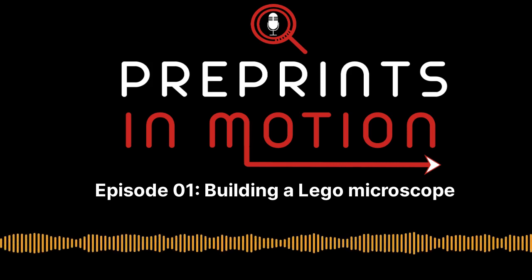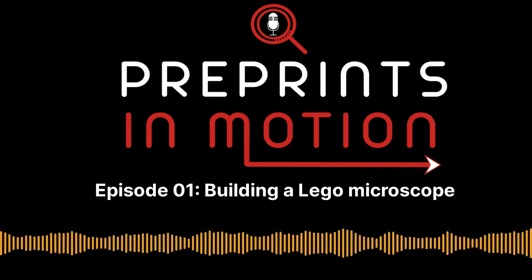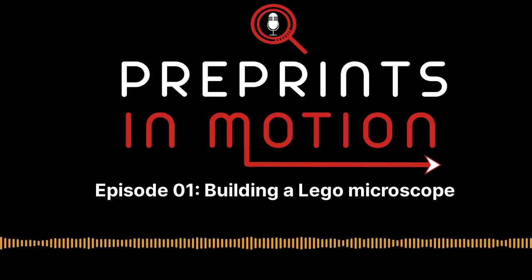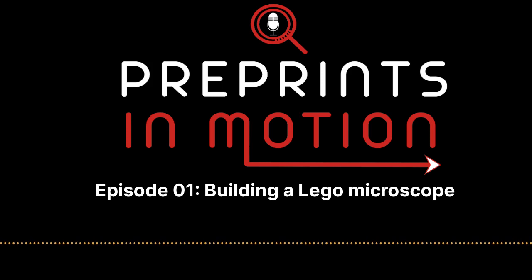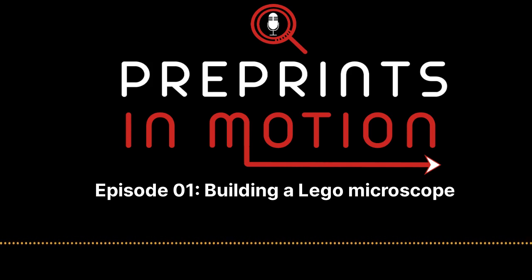So this actually has real world use then, right? At that resolution. This is very close to what we can get in the lab. Of course, a microscope in the lab is 100 times more expensive, and the reason for that is very simple. You can just get better images. But what we can see is essentially the same.